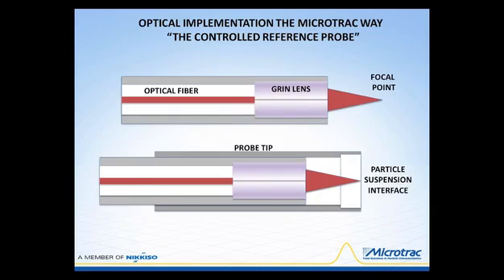The way we implement the reference technique is using a simple optical fiber to gradient index lens system that creates an image of the fiber at a point in front of the lens.